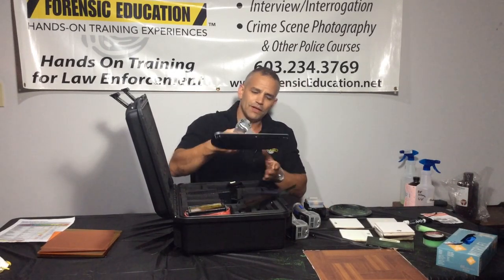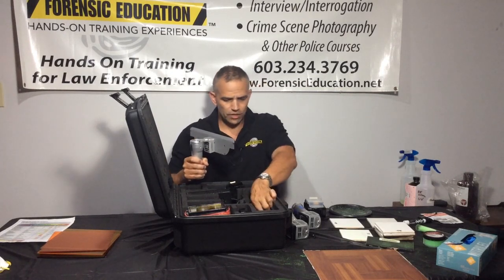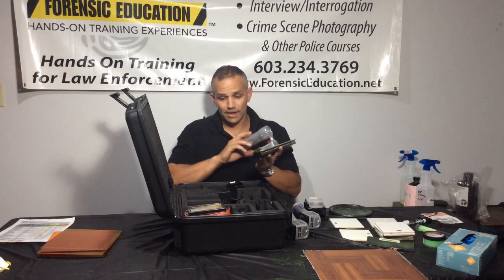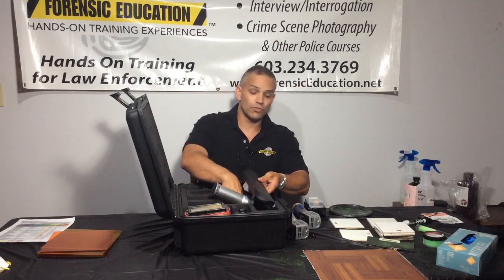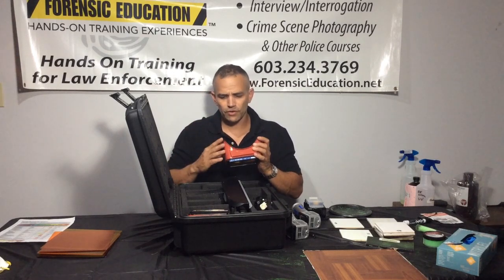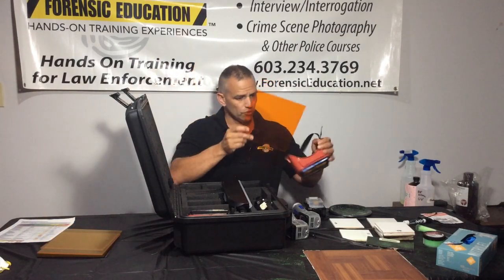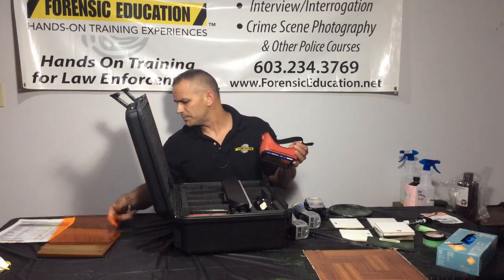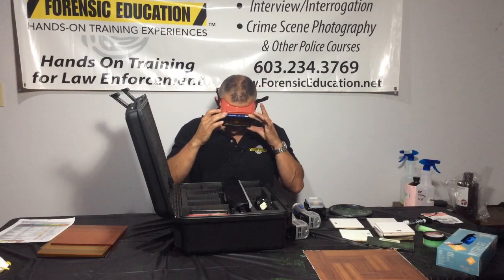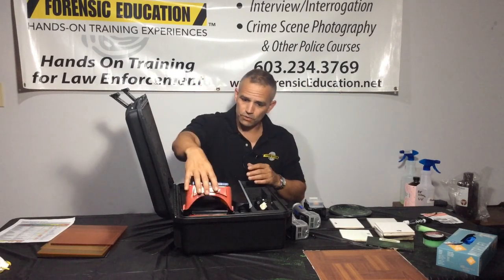I also have another light I'm going to save for the end — it runs off the same battery and it's unbelievably strong. They have different color filters you can put on them, and we're going to use it to locate foot impressions. Now, another unique product in here are the filters — these goggles cover everything so you're not getting any outside light, only seeing what's being filtered through the lens. That's one of the best parts of this light.